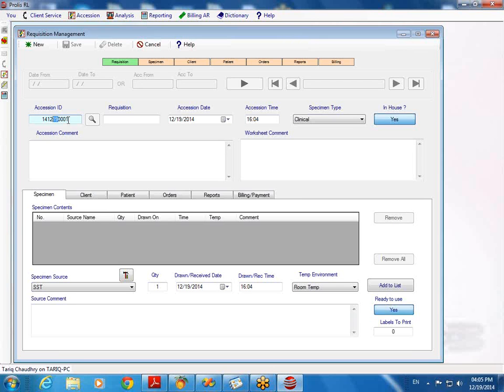And in terms of the specimen type, is that something that can be changed as well to create multiple different kinds? Yes, specimen type clinical means that if you receive the specimen from a clinical practice, like a patient specimen, then you leave it default as a clinical specimen type. What I mean is whether we can customize that.